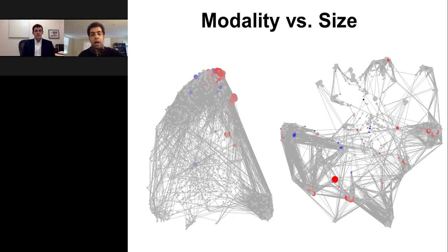Another issue was that some of the larger data sets may actually have less information in them. This is a large data set that only has 3 major clusters, maybe 4, and then this is a smaller data set that has many, many clusters.